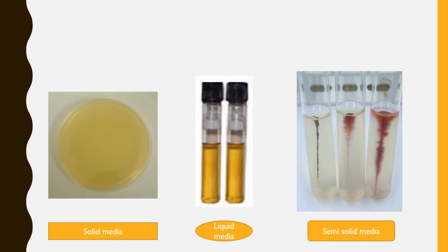This is the solid media, this is the liquid medium, and this is the image of the semi-solid medium. This is the picture of growth motility of the bacteria in the motility agar or indole agar.